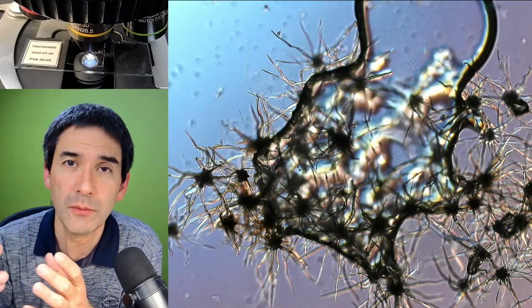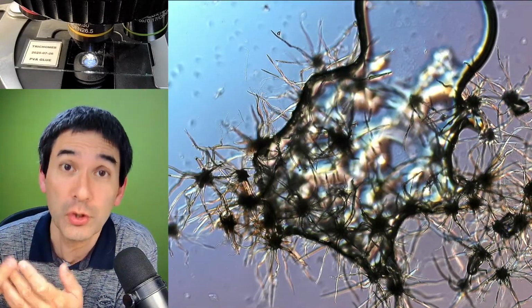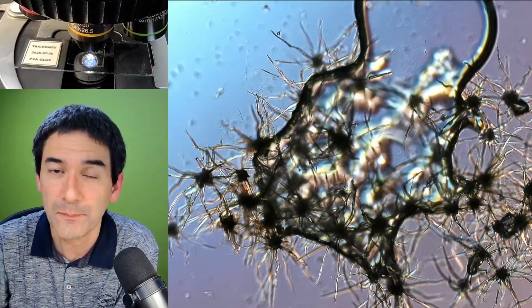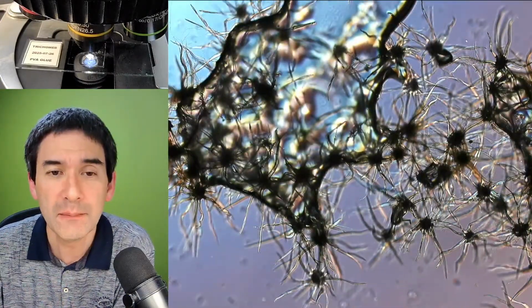Because some of those insects or mites might actually feed on the sap, on the juice of the leaves. They want to bite the leaves maybe, and if there's this fuzzy layer on there, then they're not able to actually reach the cells. So that could be one reason. And another reason is very common in plants.